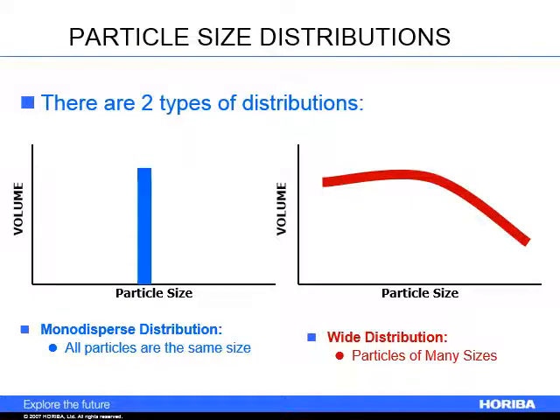All your particles are the same size or roughly the same size. So what you have is a really nice, that's showing it as a rectangle, but in reality it's just a very nice, large, sharp peak because everything is roughly the same size. And then your math holds for that.